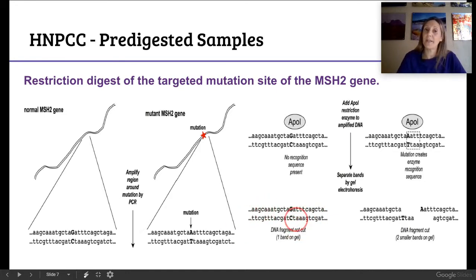And if you're homozygous mutation, which is pretty rare, then you are going to have 2 copies of this DNA sequence, both of which are going to get cut. And if you're heterozygous, then you're going to have 1 of each. And pretty much because this sequence has been isolated through the process of PCR, it is a certain size. And so the 2 fragments here should pretty much equal the size of this 1 fragment that has not been cut with our restriction enzyme.